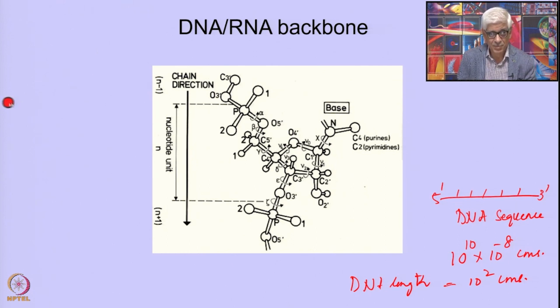And this has to be unpacked when it has to be expressed, when the mRNA has to be produced and then the proteins have to be produced. Therefore, you can imagine how complex this whole process is, and a lot of research goes on in trying to understand all of this, and how NMR can contribute is what we are going to see.